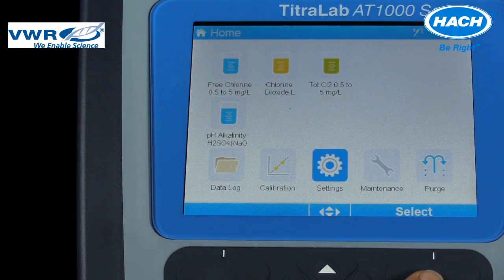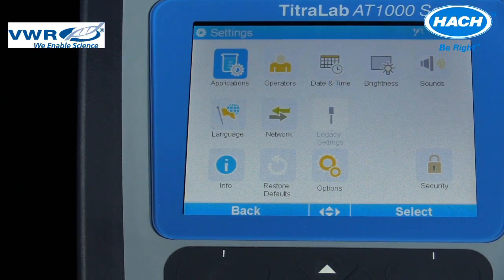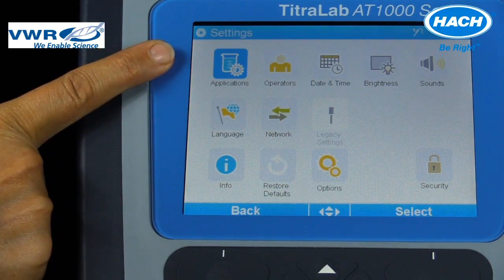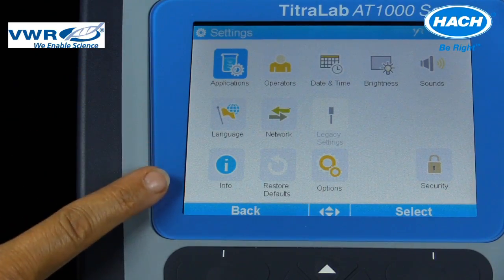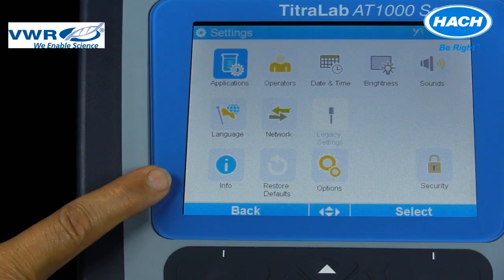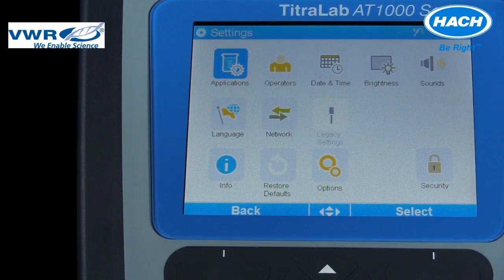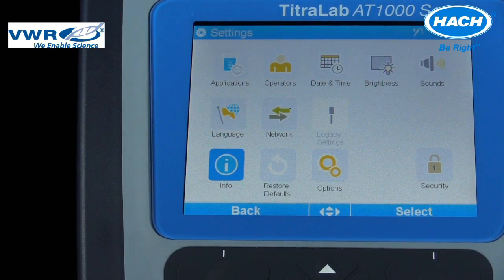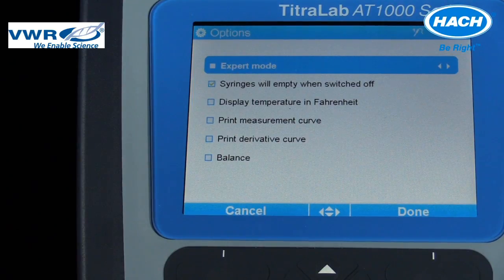By selecting the settings icon, the application settings can be accessed, operator information entered, and instrument settings such as date, time, display, sound, language, network, and security can be changed. Also on the settings menu, you will find instrument and electrode sensor information and additional options to cause a specific action of the instrument. The options key can be used to set the application parameters to expert mode, which lets the user customize the standard measurement applications.